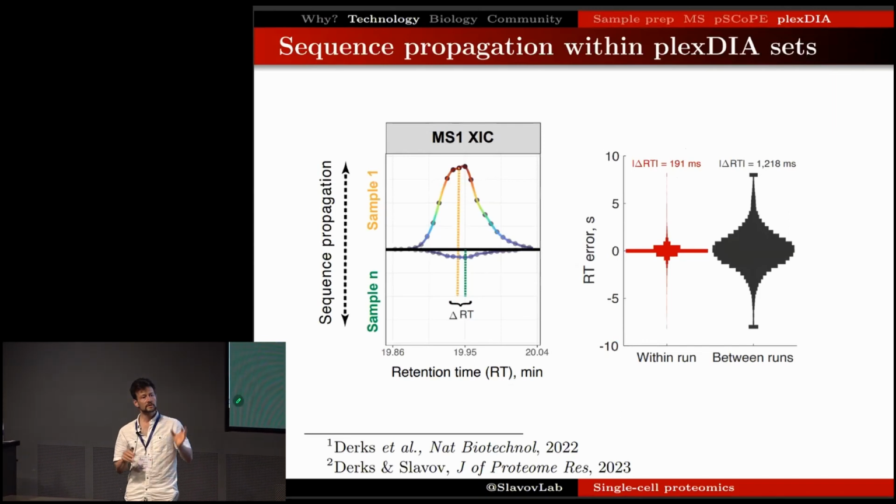And one of those is that if one uses certain mass tags, in particular mass tags that are not deuterated, some labels such as dimethyl labeling introduce deuterium that can shift retention times, but with certain mass tags, and in this case we're showing this data for mTRAQ, retention times don't change for peptides labeled with different versions of the mass tags. So we could actually quantify how precisely the same peptide from different samples is going to coelute together.